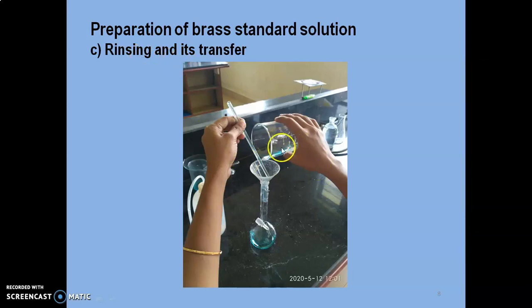The solution in the beaker has to be added to the standard flask by using the glass rod in this way. The beaker and glass rod has to be aligned in such a way, so that the solution will go into the standard flask through the glass rod.